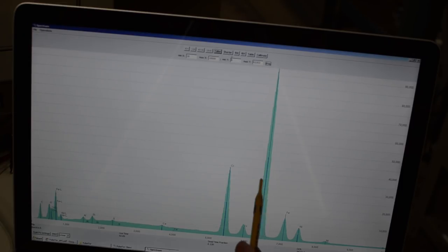Let's take a look at that in the spectra. This huge peak here is iron. It's cut off there. We've got two chromium peaks, iron, nickel. I would expect all of that. There's some stuff from the detector here. The silicon. Some of that's from the detector. Some of that is from the stainless steel. The sulfur is from the stainless steel. I would expect that as well as fingerprints. There's also what appears to be calcium. I'm not completely sure that it is, but it's very plausible. I've seen that before when looking at other stainless steels. It's going to be an impurity. I've seen it before, so I don't think it's an artifact. I'm pretty sure I'm analyzing it correctly.